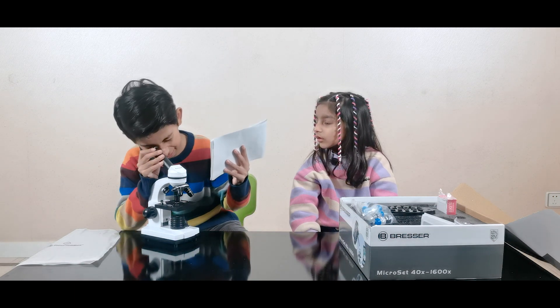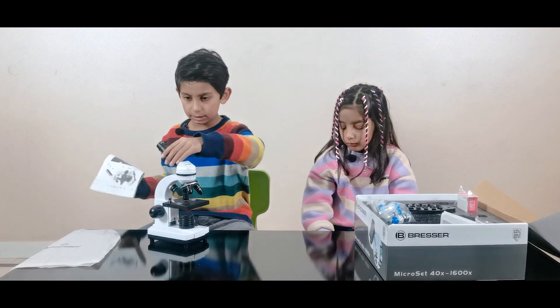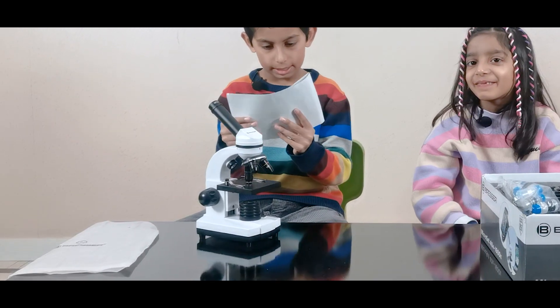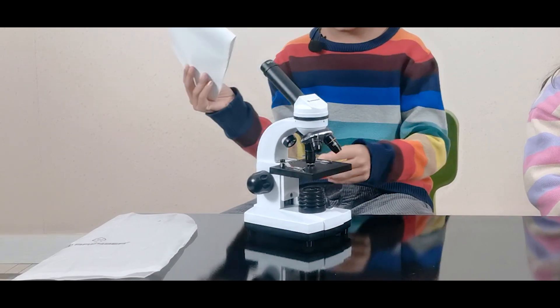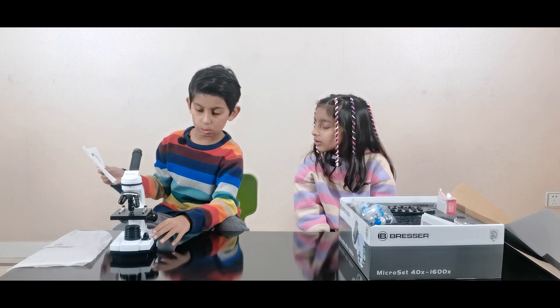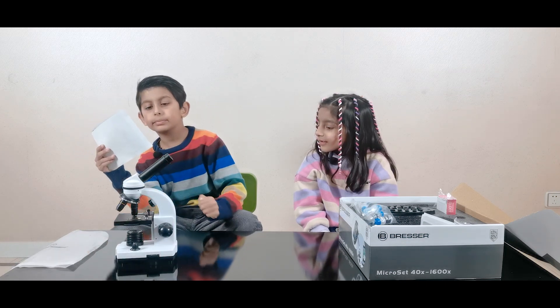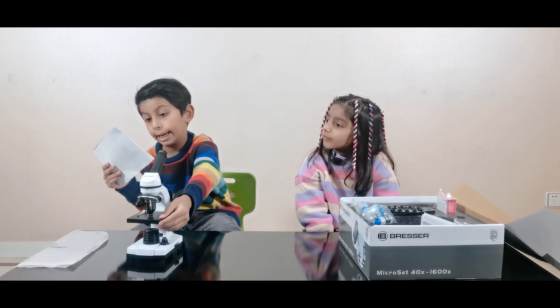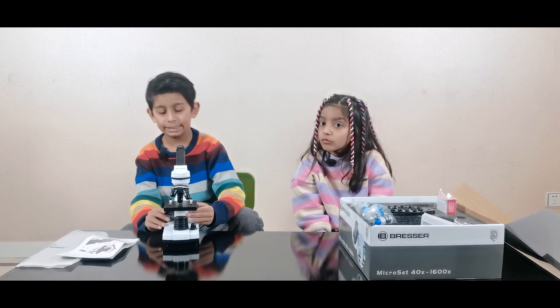This is the eyepiece to see the things that are clipped to the stage clips. This one is the tube, and this one is the arm to hold the tube. This one is the coarse focus to see how far or how close it is, and this is the fine focus. This one is the brightness adjustment, this one is the base — the black base — and this big thing is the light bulb. And this is the stage, and these two are the stage clips.